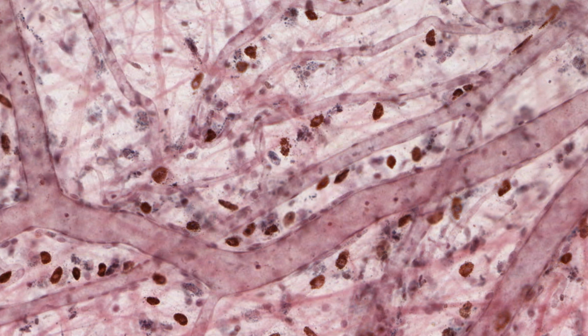The rat which generously contributed this tissue for this image received India ink. And the population of histiocytes, or macrophages, in the tissue spread is beautifully marked by the ingested black or dark grey particles. The tissue has also been stained lightly with hematoxylin and eosin to reveal other cells and extracellular components.